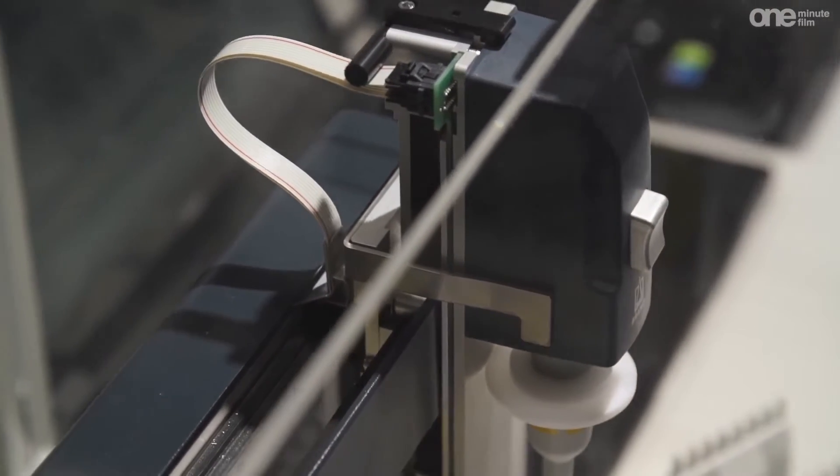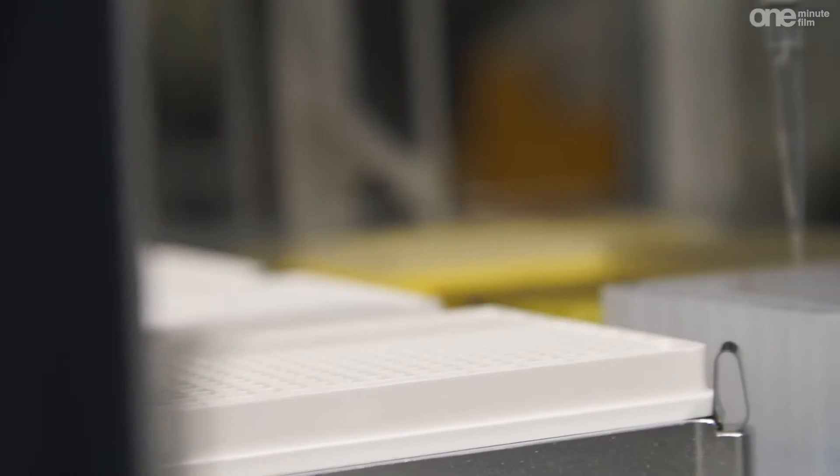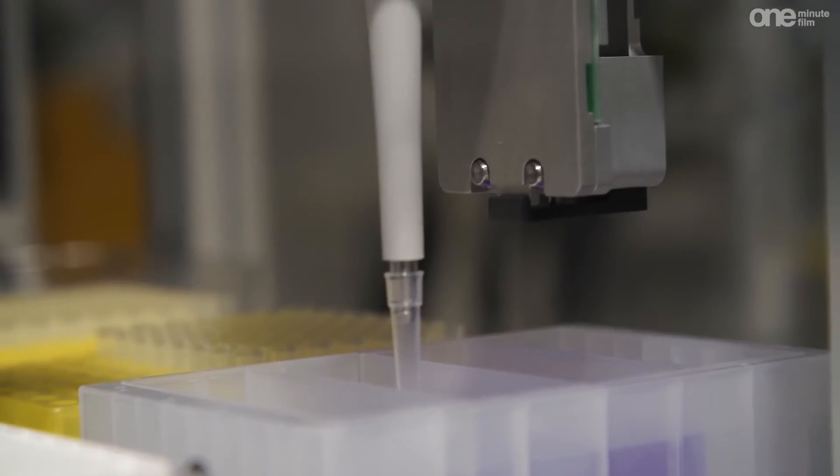One of the advantages of the LHS is the productivity improvement it delivers, allowing you to occupy yourself with other work while the robot is running.